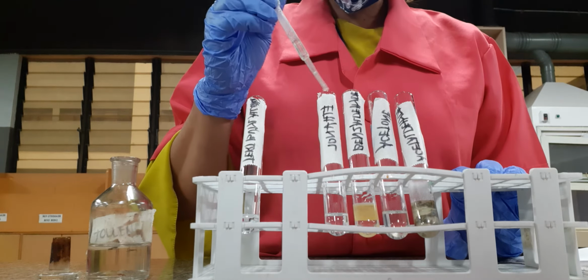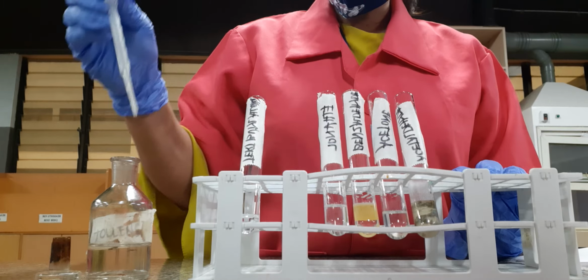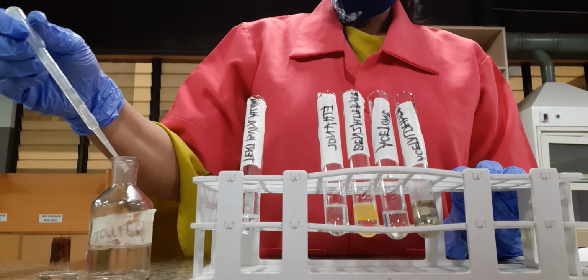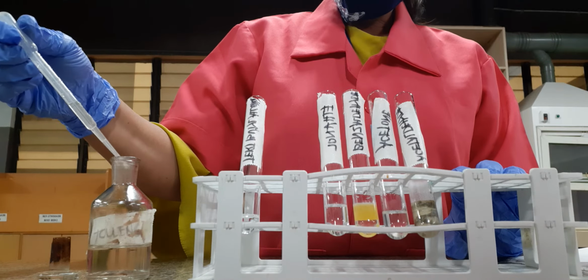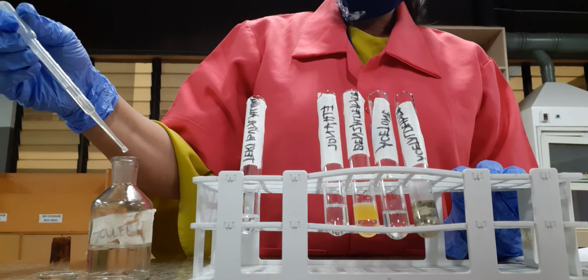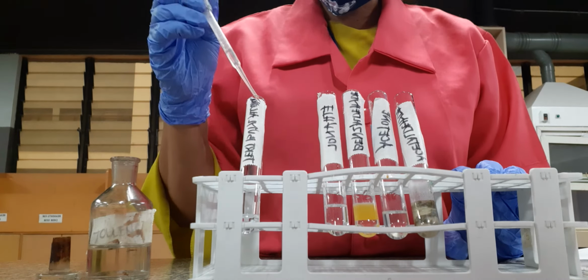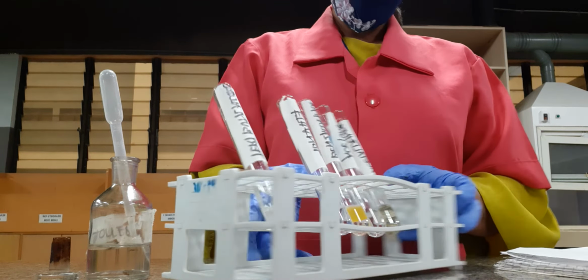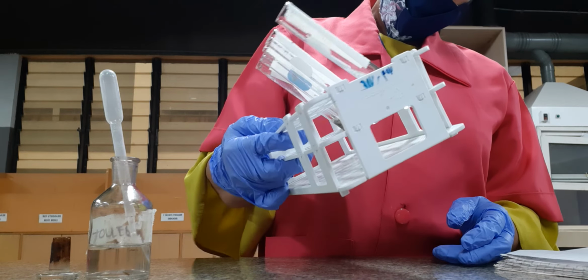So we have ethanol plus 1 ml of Tollens reagent. And then we have tert butyl alcohol. Okay? So we'll shake this and then we'll subject this to a hot bath.